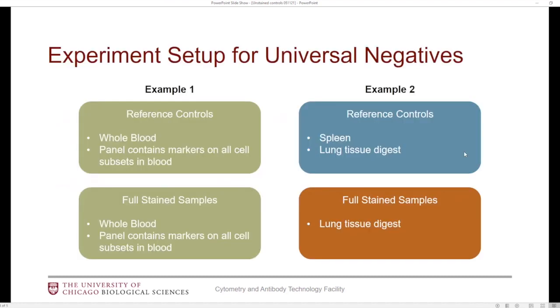I'm going to switch over to SpectroFlow to talk about how to set up the universal negatives. If you have a single tissue — so the same tissue for controls and fully stained samples — but within that panel you have markers that are on lymphocytes, monocytes, and granulocytes, that's one example. A second example is maybe you have multiple tissue types, where you've done some optimization and determined that you can use spleen for some of your reference controls and lung tissue for others.